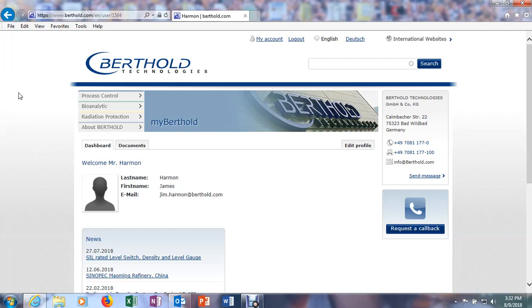So you will want to go to www.berthold.com and create an account. This will enable you to download documents, manuals, and software, including the application PC software so you can communicate. And first thing we'll do is, okay, you can see here that I've already created myself a name, username, and password and stuff.